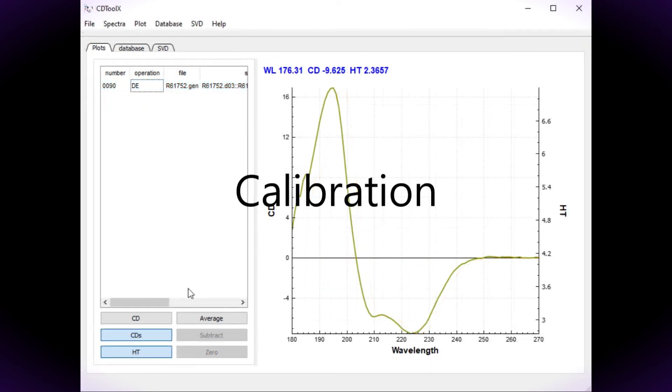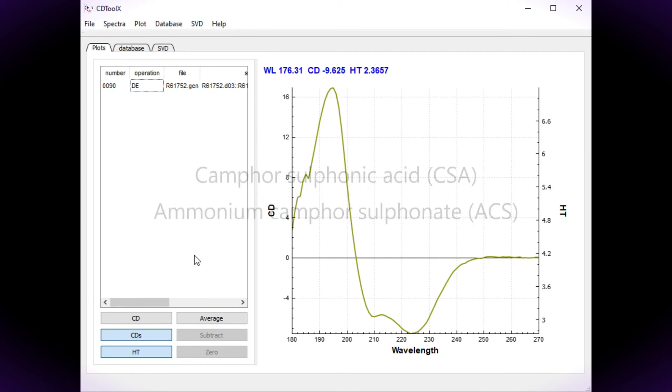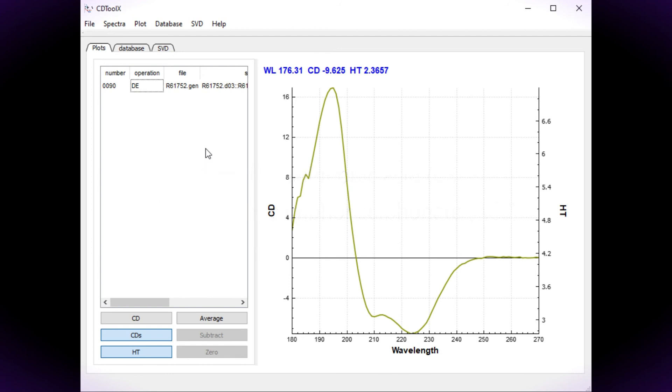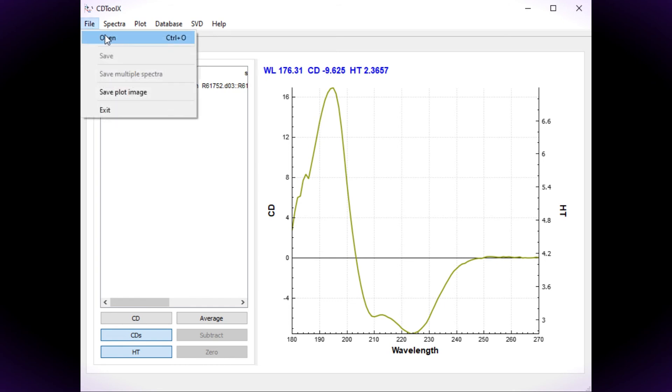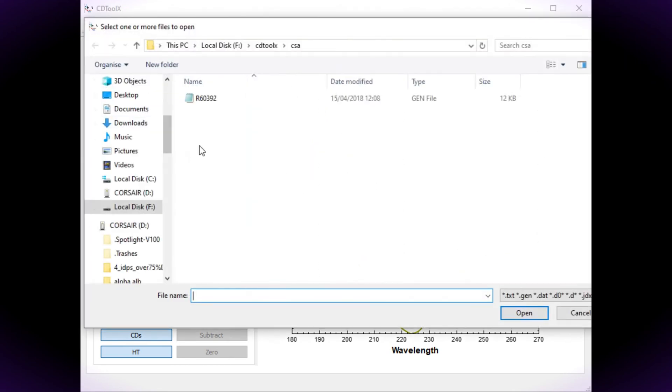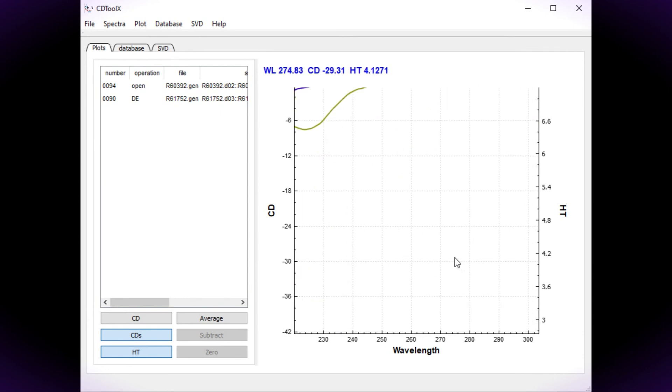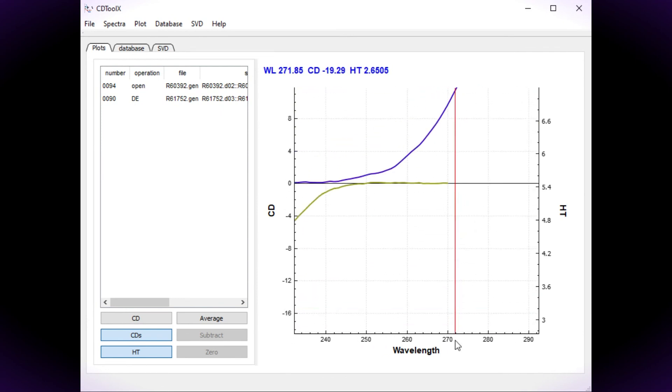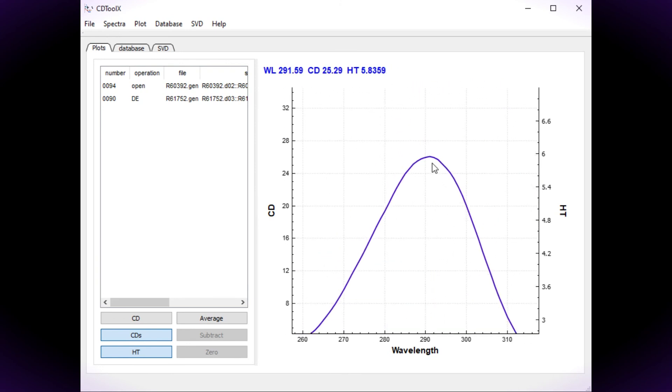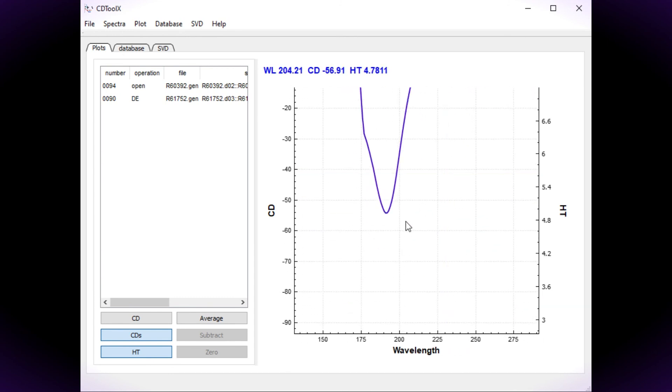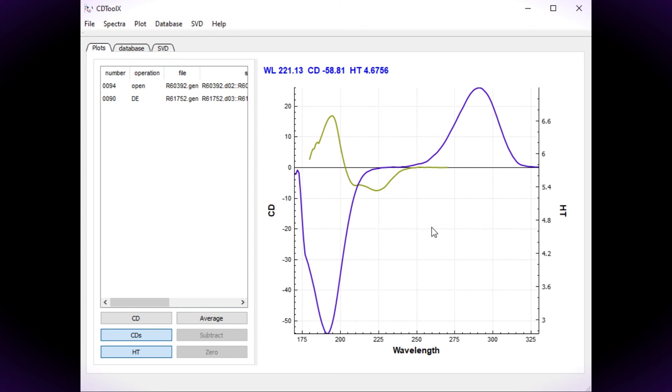You can also calibrate the spectrum using the spectrum of camphorsulfonic acid or its ammonium salt. Calibration is described in the first video of this series. Open the appropriate CSA file and find the CD values of the 290 and the 192 peaks. You can zoom into the peaks using the mouse wheel and you hold down the left mouse button to drag the view. Double click the plot to reset the view.